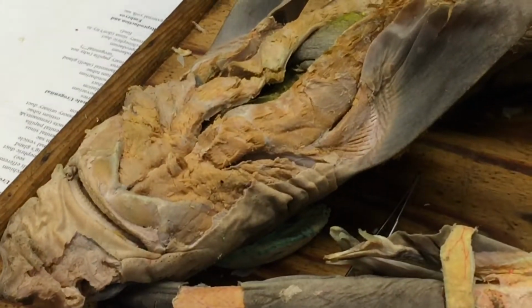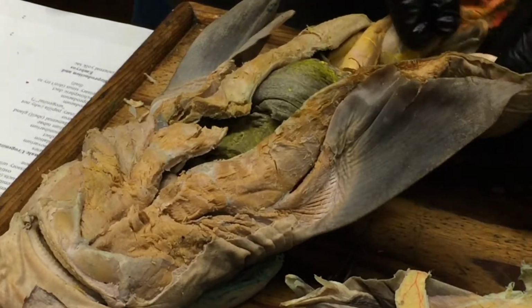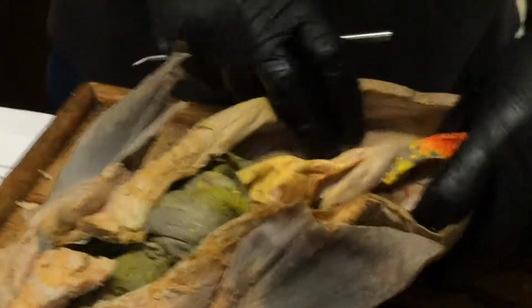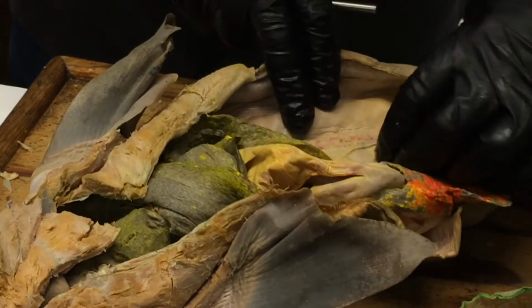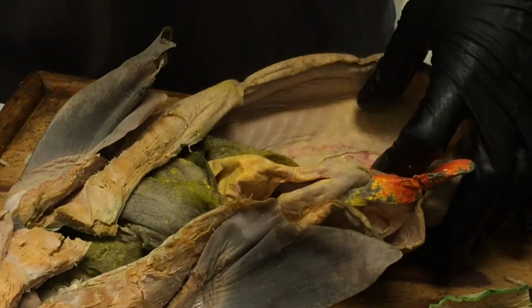Okay, archinephric duct. I'm not sure. Did you guys dissect into your kidney at all here to try to find the archinephric duct? Oh, it's such a pain for a female. Well, I don't know. Should we take a look? Should we try? Yes. You don't mind? We trust you. There's your first mistake.